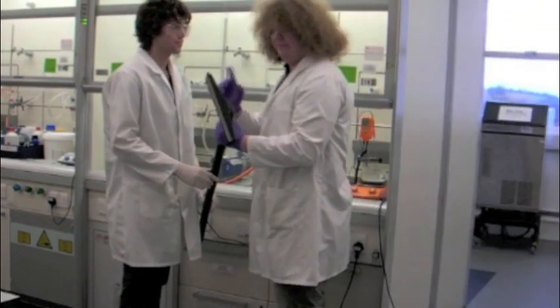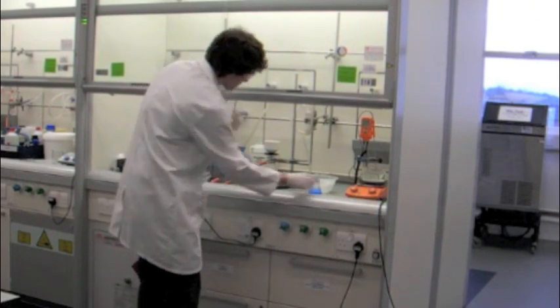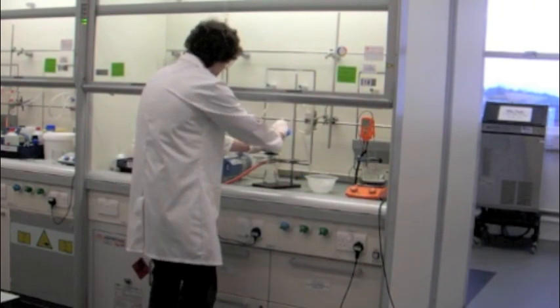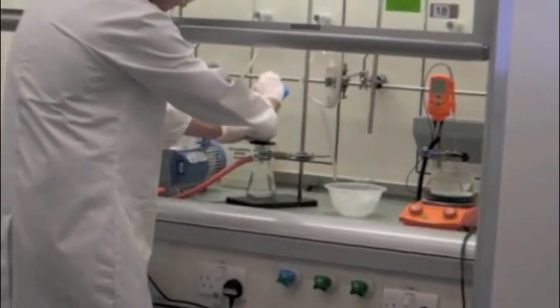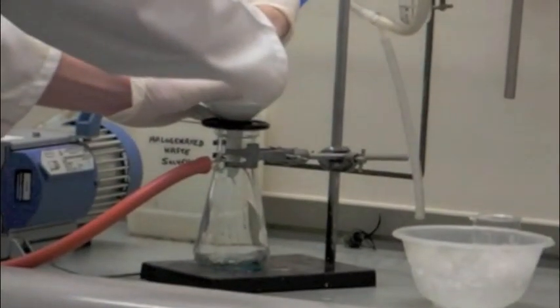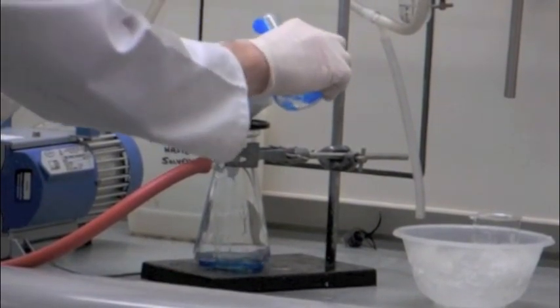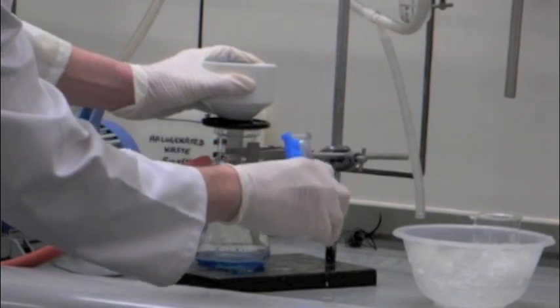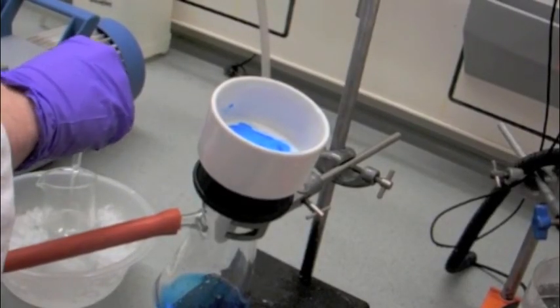No, not using a hoover. Instead, we use a Buckner flask.